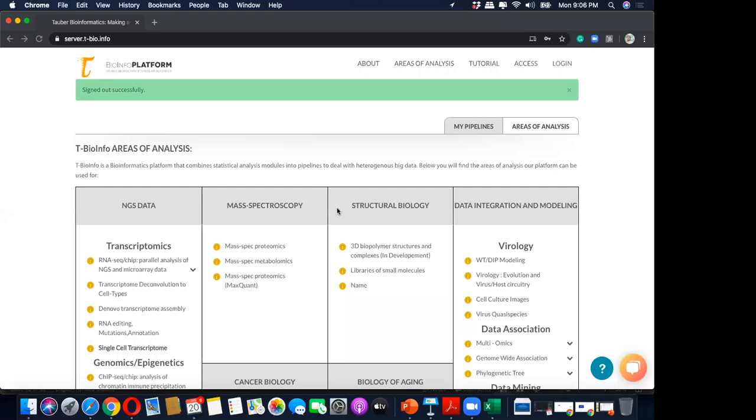So that's the mapping. After mapping is done in the entire genome or the transcriptome, where all the sequences have been placed, the next step is to find out what this is. That is the step of annotation, where you find out about that particular gene: this part is the exon, this part is the gene, because you could map it with a reference genome. Does that answer your question, Srijini?